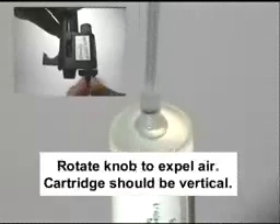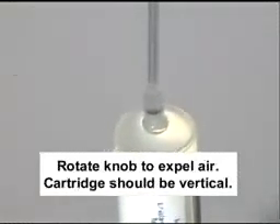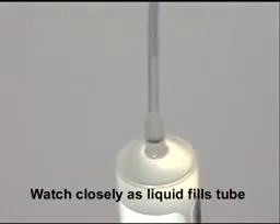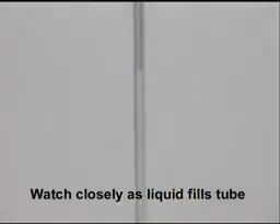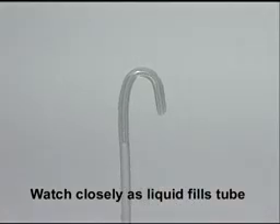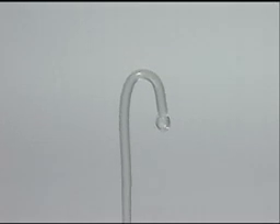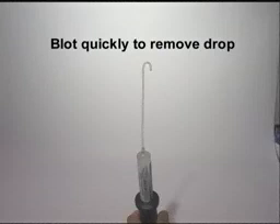Rotate the knob to expel air — the cartridge should be vertical. Watch closely as liquid fills the tube. Dispense several drops, then blot quickly to remove the drop.